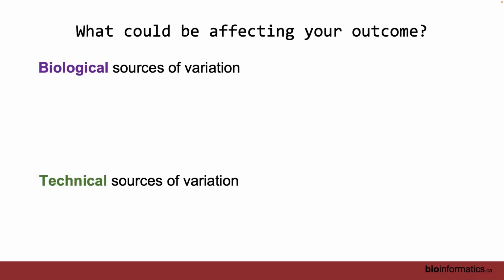Suppose you have a data set of 1,000 people that you ran genomics on, right? Now, was the data for all 1,000 of those samples generated by the same person? Was it all generated on the same day? Was it all generated with the same reagents? So what are examples of technical sources of variation? I pretty much walked you to that. You can write down the batches. Batch effects, right? So you have batch numbers, so you compare between batches.